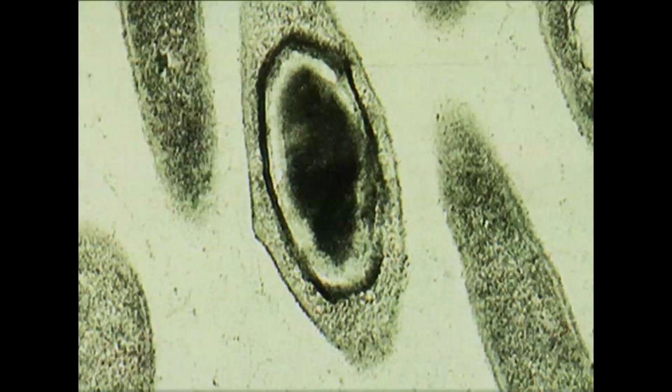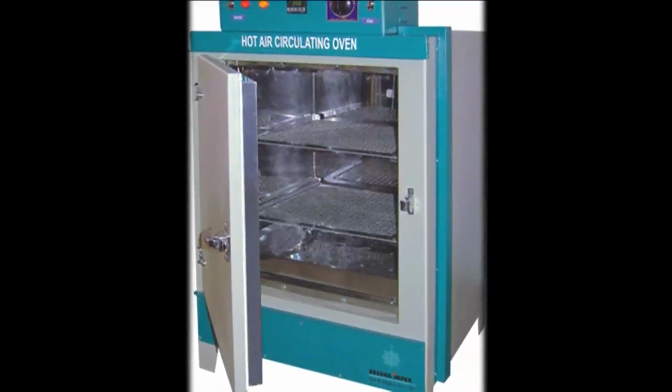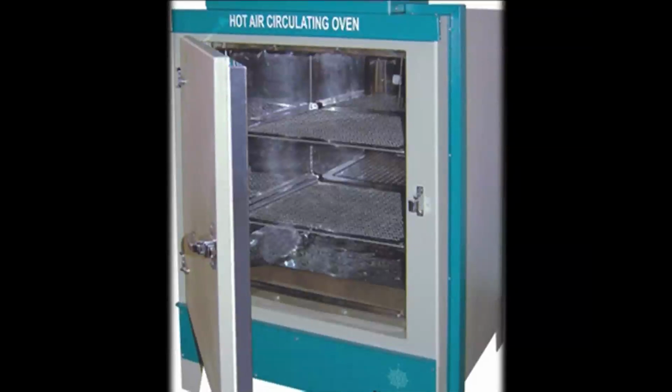Here, dry heat carries out oxidation of the proteins. These oxidized proteins lose their efficiency, and since most of the enzymes within our system are proteins in nature, because of this high oxidation rate the enzymes get inactivated and the microbes die off.